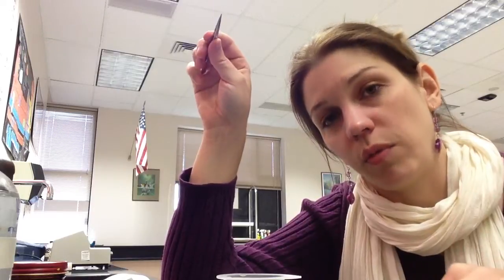So to that end, you're done. And you're going to do 5 discs of the DI water. You're going to do 5 discs at 1.5%. You're going to do 5 discs at 3%.